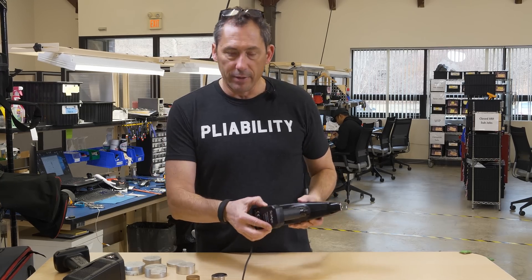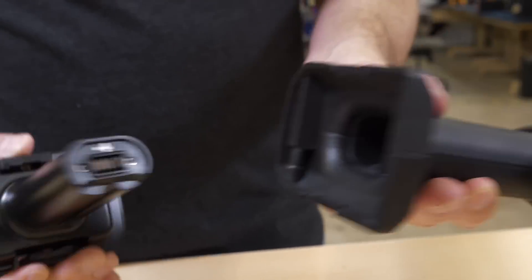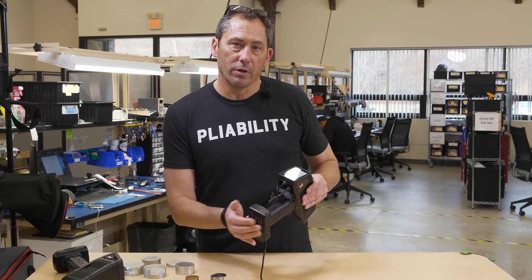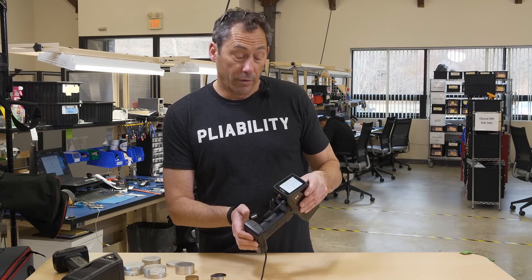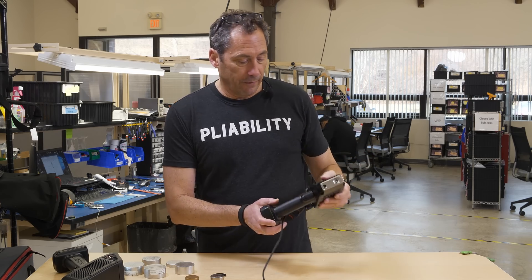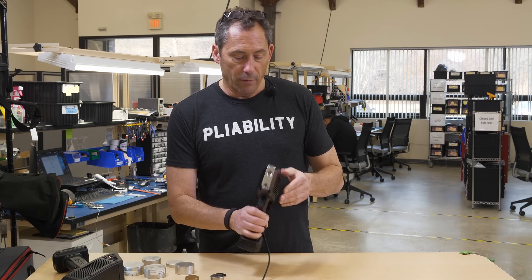The battery is under here — you pull the battery in or out, and it charges with an external charger. It's got a hot swap, so as long as you put the new battery in within a minute, you don't have to reboot the unit. That's the quick story about the 550 — it's great on turnings and all kinds of different metals.